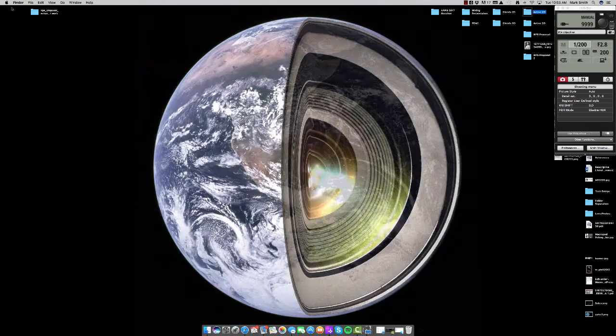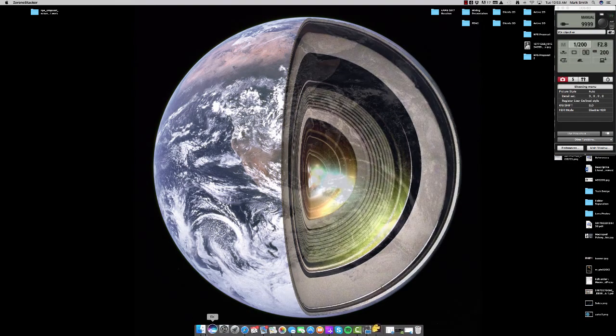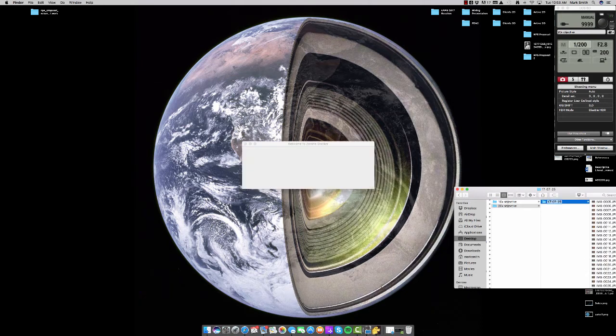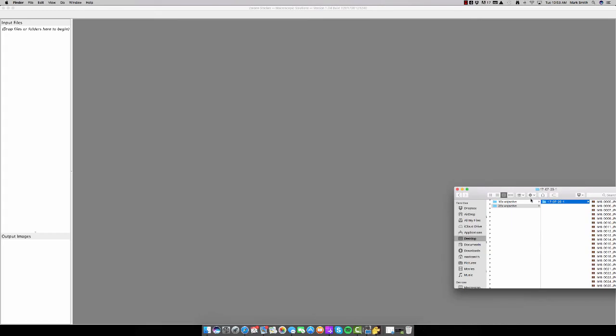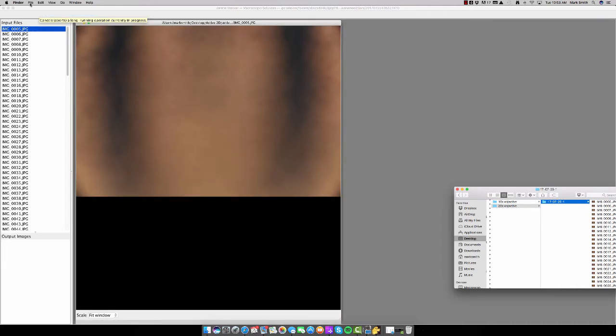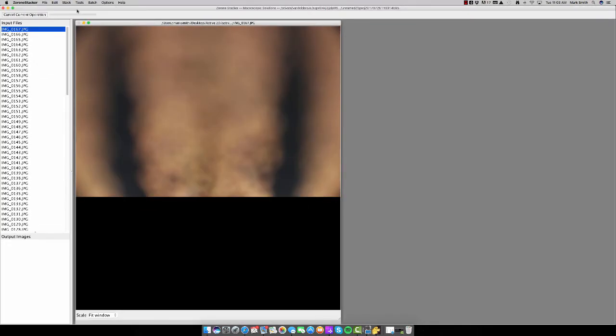So what we're going to do now is close the quick preview window and open up our Zerene Stacker stacking software. We want to navigate to the 20x objective and put a one behind that folder so we don't conflict it with another folder if we want to capture more images. We'll drag that folder into the input files section in Zerene Stacker, and we're going to reverse the order. When we captured the images we captured from back to front, but using all of the objectives — at 10x, 20x, 50x, and 100x — you want to reverse the order and stack from front to back, and that will eliminate any clipping from occurring on the outer perimeter of the image. So go to File, Reverse Order, and now we'll start to stack — line and stack all using Pmax.